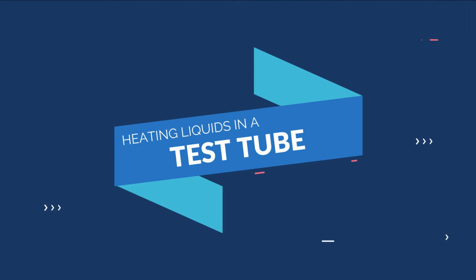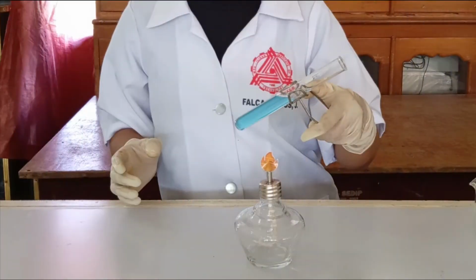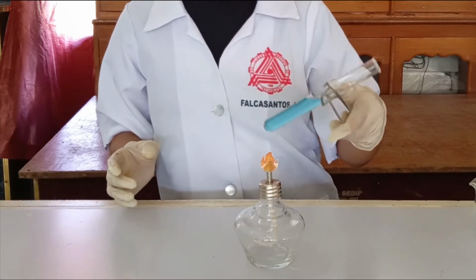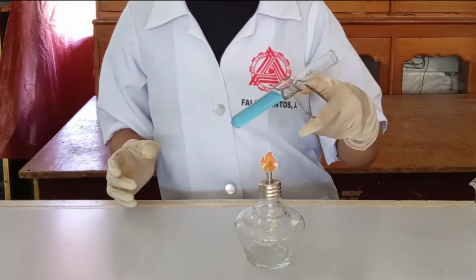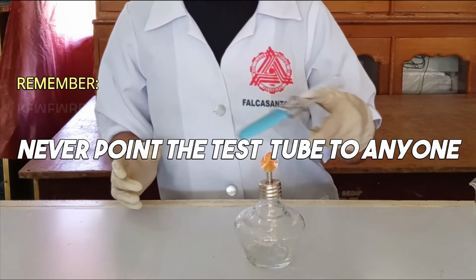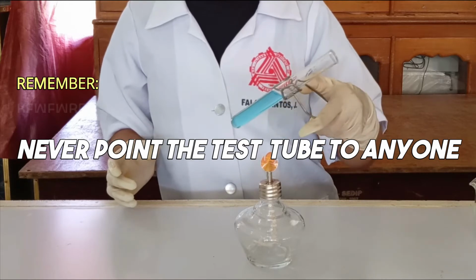Heating liquids in a test tube. The test tube should be no more than 1/3 full. Position the test tube at a 45 degree angle. Move the test tube circularly in and out of the flame, heating from the top to bottom. Never fix the flame's position at the base of the test tube. Never point the test tube to anyone. The contents may be ejected violently if the test tube is not properly heated.